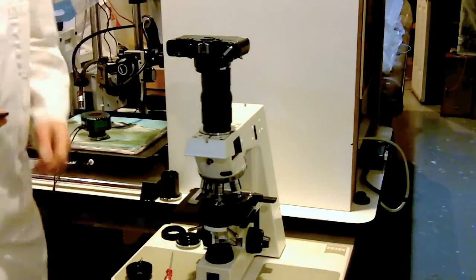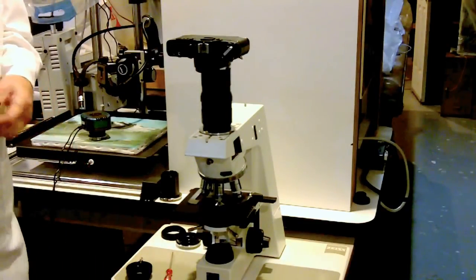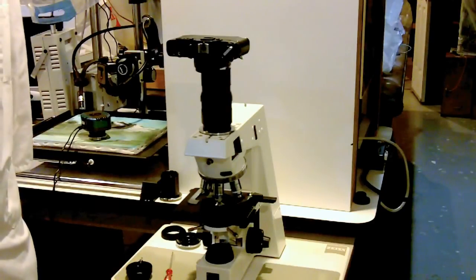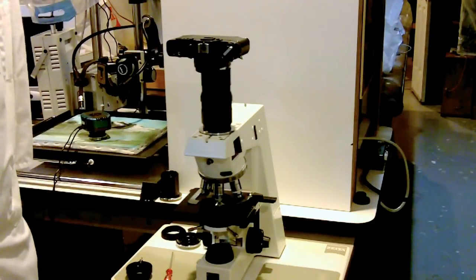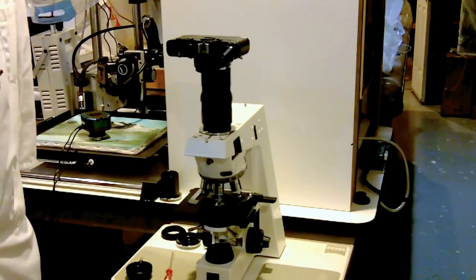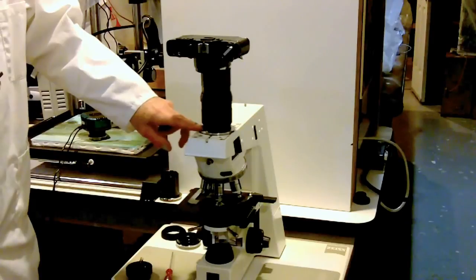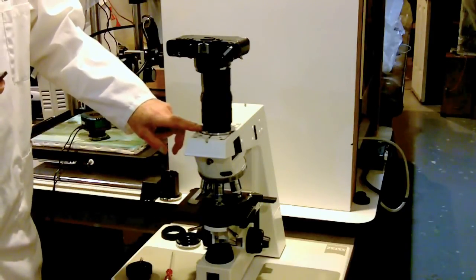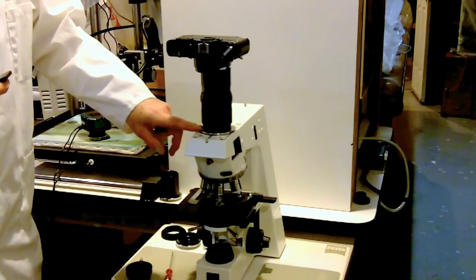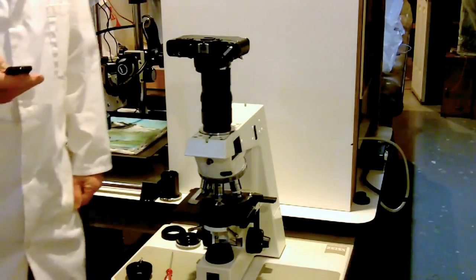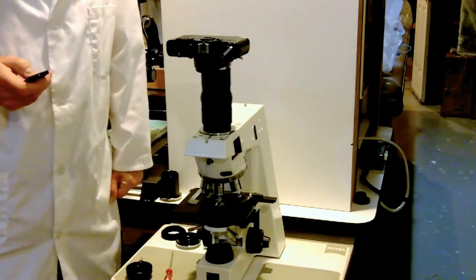So keep in mind this way to bring old microscopes back to life. Put new optics on, save your department a lot of money, and just buy an InFocus for your particular microscope make and model. And we can give you guidance on that. So thank you for your attention and we look forward to hearing from you.